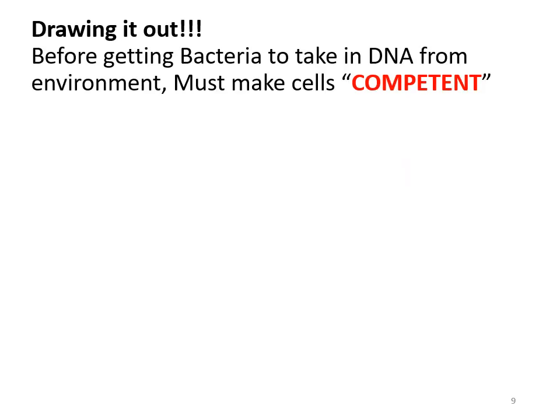So now, in a gene transfer experiment like transformation, where you have DNA coming from the environment around the cell, where it's not in any other structure, such as a virus or another bacteria, you have to make sure that you make the cells competent. And competent means ready to take in new DNA, okay? Meaning you have to make the cells the proper charge. So I'm going to draw out what we mean by this.